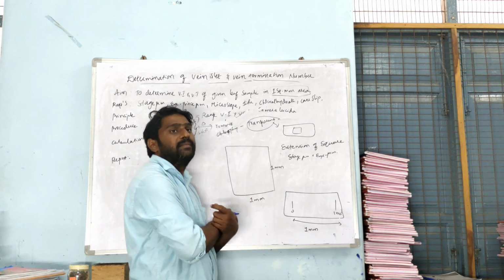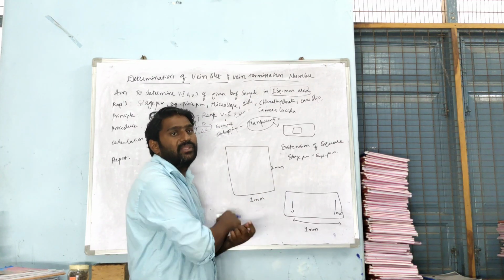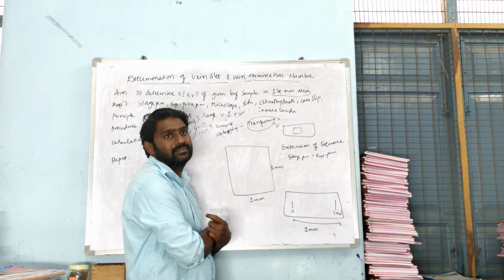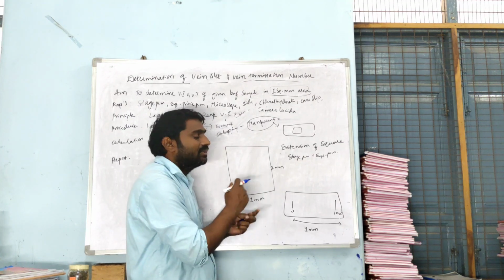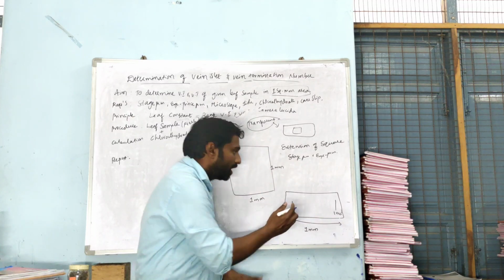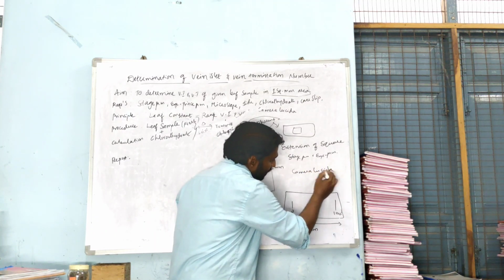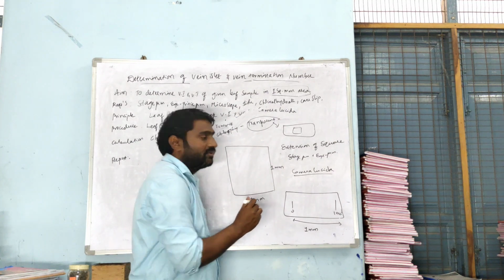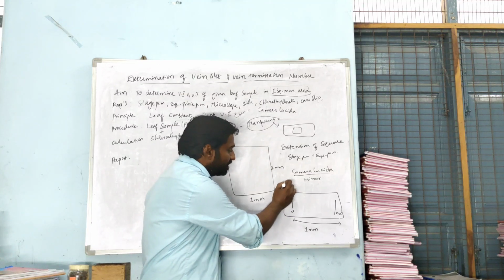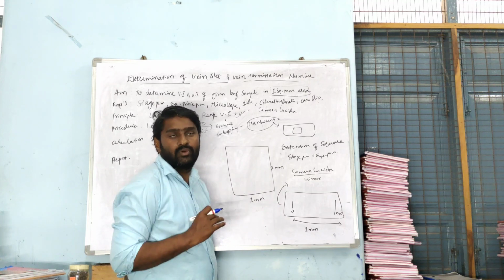When it is equal to 1 millimeter, the same scale can be traced by using a camera lucida, and you can measure the distance between these divisions. The stage micrometer is placed onto the stage, and generally we use a mirror type of camera lucida, where the image of the stage micrometer is focused onto the black chart paper fixed to your board.